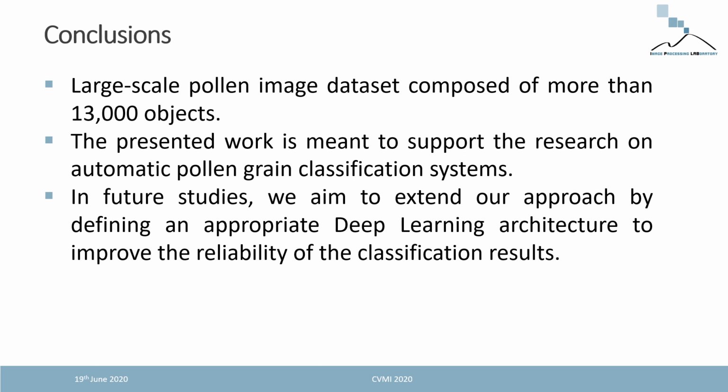In this work, we presented a large-scale pollen image dataset. In particular, this work is meant to support the research on automatic pollen grain classification. In our future works, we are planning not only to improve the segmentation pipeline, but also to define a proper deep learning architecture to achieve more accurate classification results.